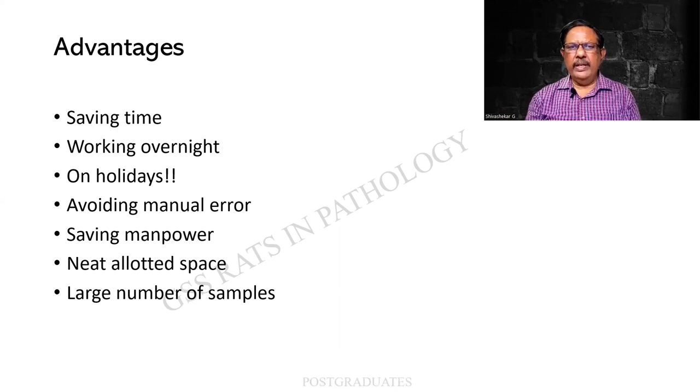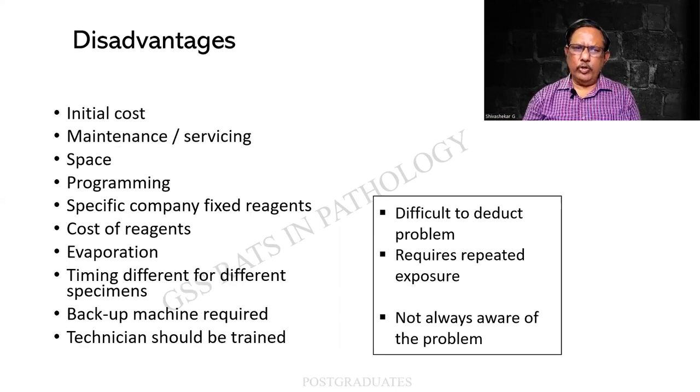Whenever I say advantage, there will be a disadvantage also. For example, the initial cost is going to be exorbitant. It will be running into several lakhs. And here again, we feel that the foreign instruments are better than the Indian instruments because of the precision. And there has to be a maintenance and servicing, which again can be costly.